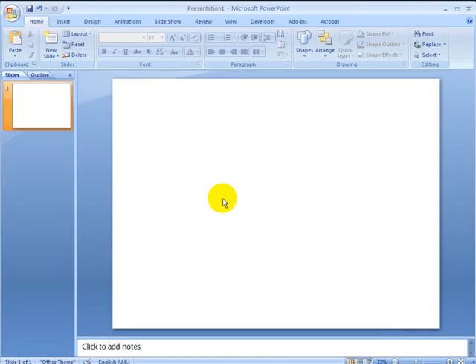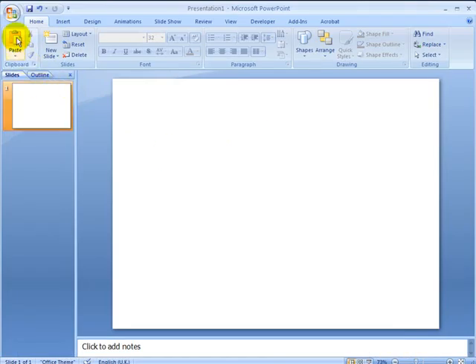When you open PowerPoint Presentation, for example, you can click Paste and that will paste that as a picture.